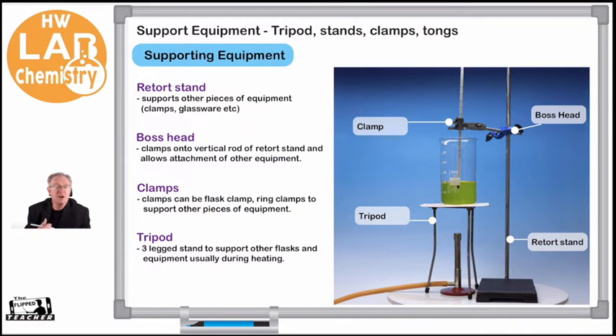Supporting equipment is basically designed to support other parts of our experiment. Often we have to heat materials, but we can't just hold them with our hand — we need another piece of equipment to hold things. Sometimes we have to heat something for long periods of time. The typical one, which a lot of people know, is this retort stand. With that stand, we can add clips to hold different things. A retort stand's function is to support other pieces of equipment — clamps and glassware.